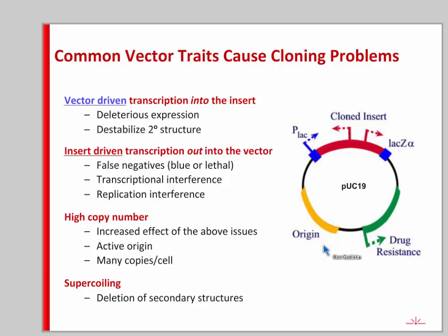PUC19 has a very high copy number, which amplifies all other issues. Anything difficult to clone at single copy is even harder at multiple copies. PUC19 and similar vectors are supercoiled, and if you have DNA with repetitive regions or long tracts of a single base type — a poly-A tract, for example — the supercoiling can cause those structures to pop out of the plasmid and be removed by recombinases, so supercoiling itself causes parts of your insert to be deleted.